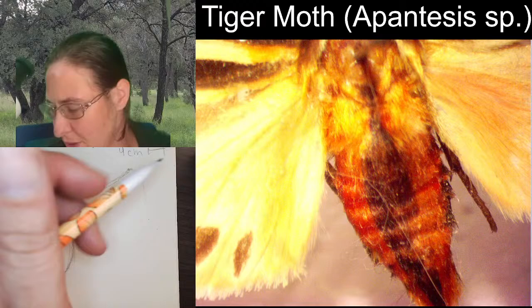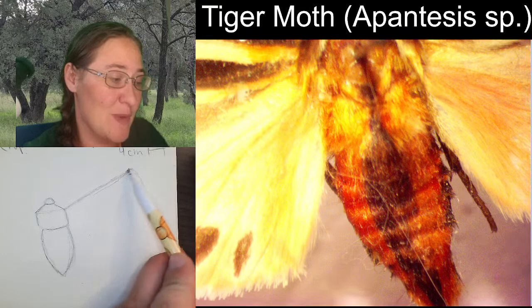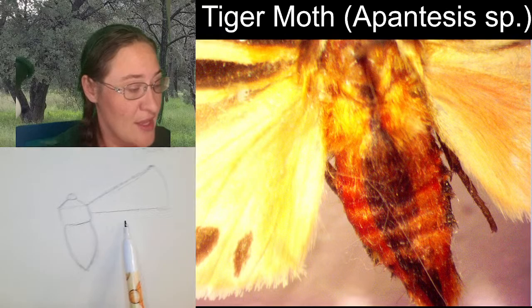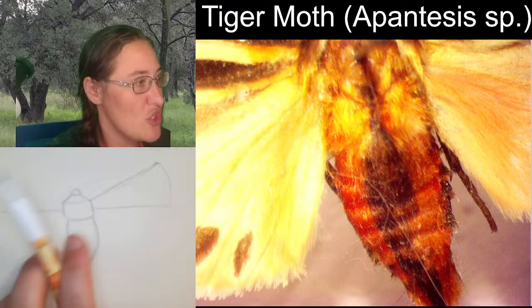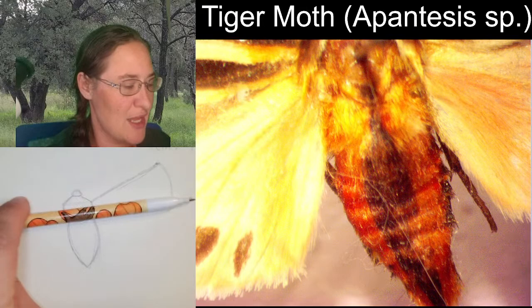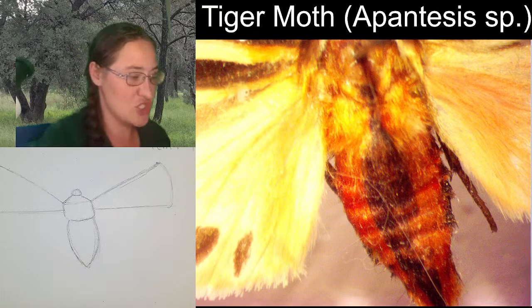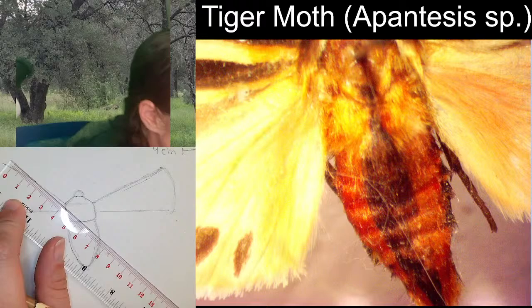When we are sketching a well-pinned specimen, the hind side, the back side, of the front wing is going to make a straight horizontal line across the specimen. So if your body is going up and down, the bottom of the front wings should make a 90-degree angle. That's a well-spread moth, or a well-spread butterfly. If you have many changes in that, then it's essentially just not as well done.